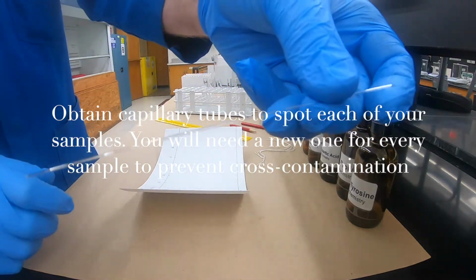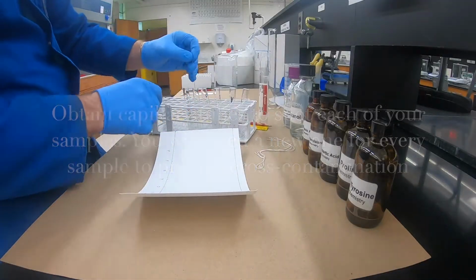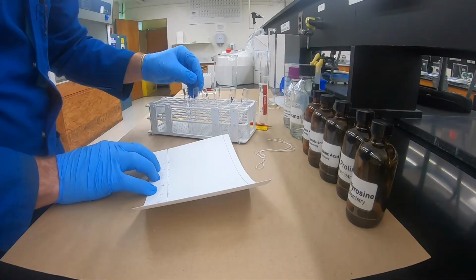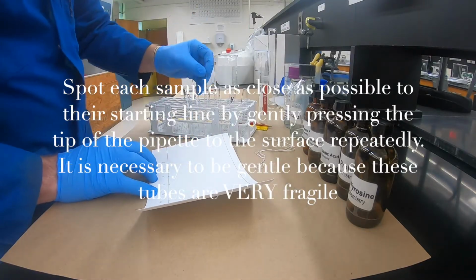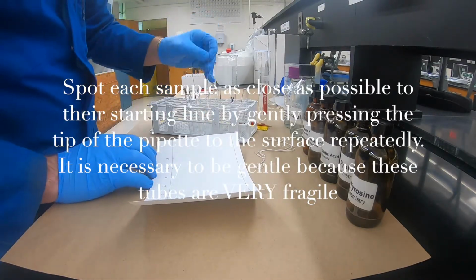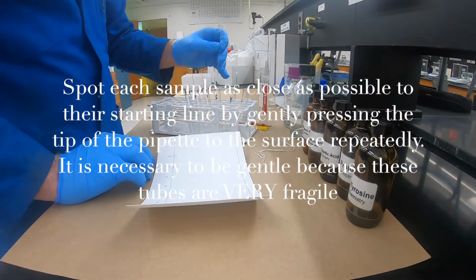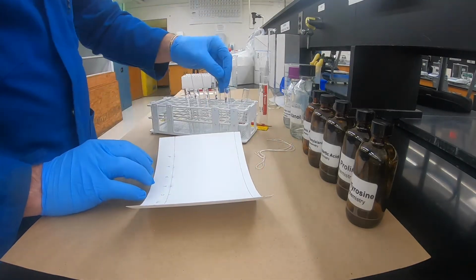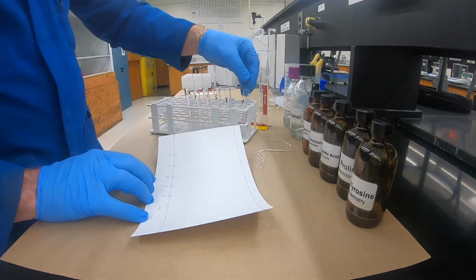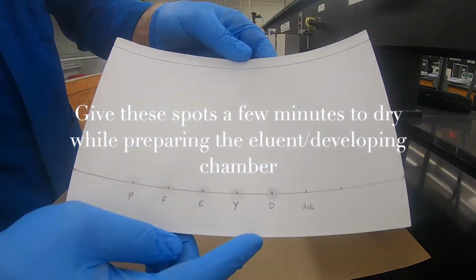You want to get some capillary tubes, and you want to get a new one for each sample. To plate the sample, you're going to take the pipette and press it gently to the surface of the Whatman TLC paper. Be careful because they will break and they will stab you and they will hurt you. Once you've spotted all of your samples, give them a few minutes to dry.